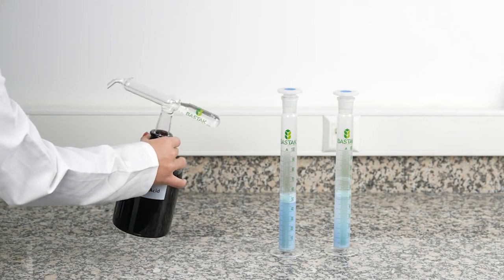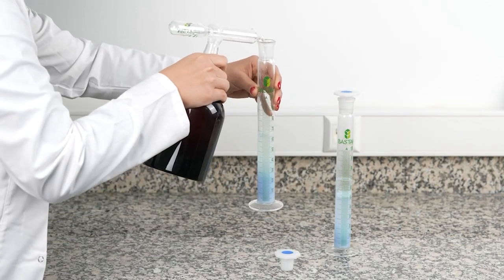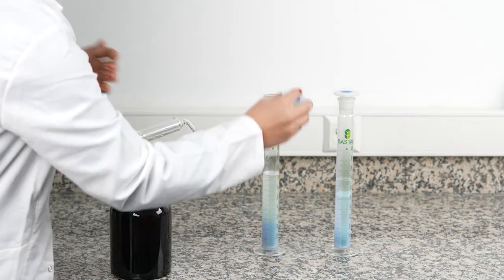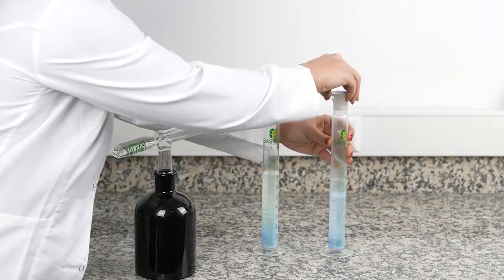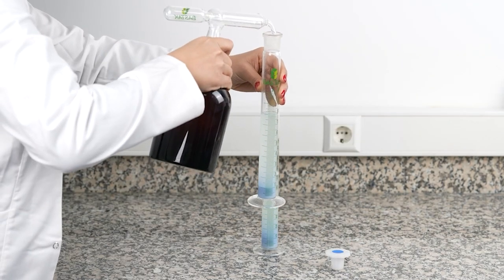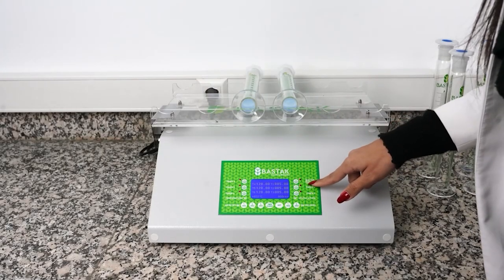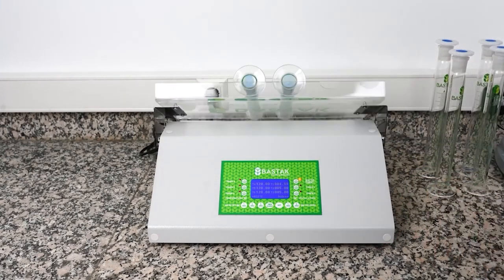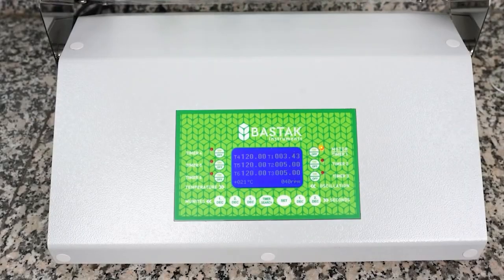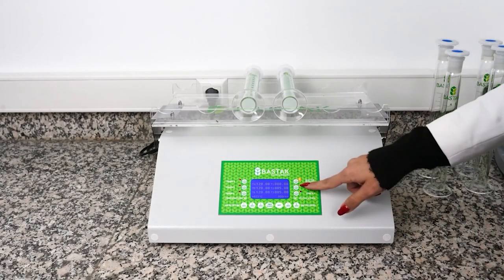Using an automatic pipette, 25 milliliters of lactic acid solution are drawn, the mouths of the tubes are opened, and the lactic acid solution is transferred into the tubes. The tubes are placed on the device's table, and the Motor Timer 1 button is pressed. The device initiates a 5-minute shaking process. When the 5-minute shaking process is complete, the device provides an audible warning.